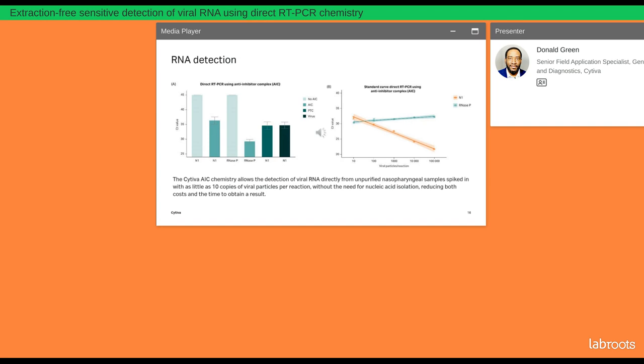suggestions, obviously. The plot shows the results combined from 3 independent experiments with technical replicates run each time. The positive control primers are targeting the human RNase-P gene, which I'm sure you're very familiar with. We also used a plasmid template control, which is a plasmid coding for the same artificial sequence contained in the viral particles. And then we did an artificial virus containing a portion of the COVID-19 viral genome in that last portion.